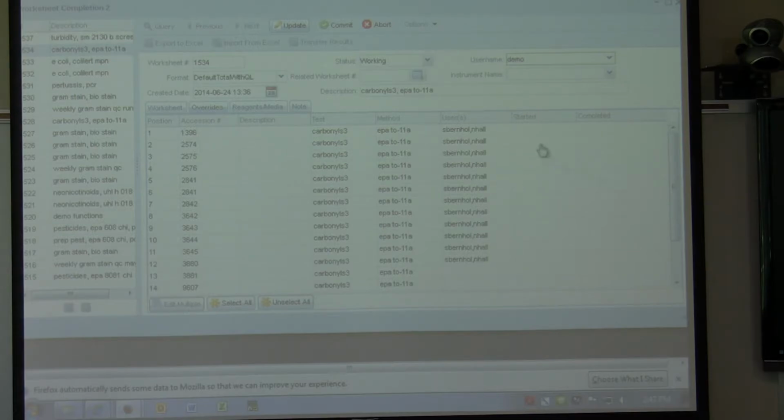View multiple users. And from previously, you would lose that if you were to generate your Excel worksheet. This one will actually keep it indefinitely. So all the values that you put on your worksheet, it's kept as to what you said for the time you said.